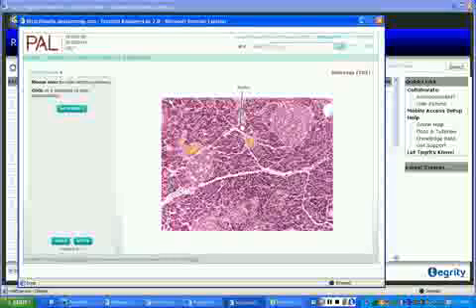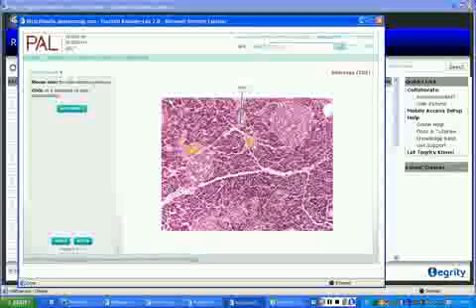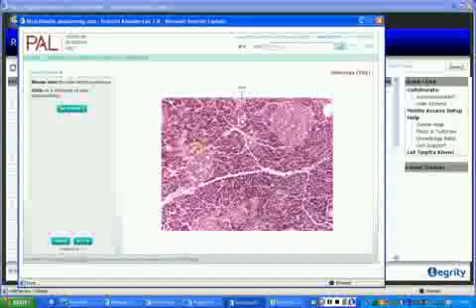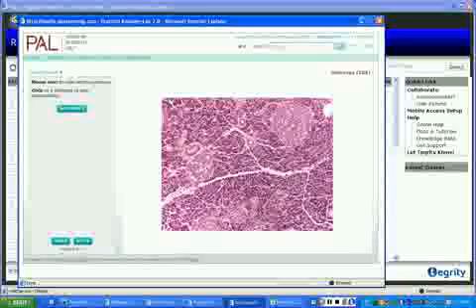Those are ducts. They could also be blood vessels depending on what's inside of them. Ducts or blood vessels. Don't be fooled. Those are not islets. How would you know they're a duct or a blood vessel? They're hollow. How would you know if it was a blood vessel instead of a duct?